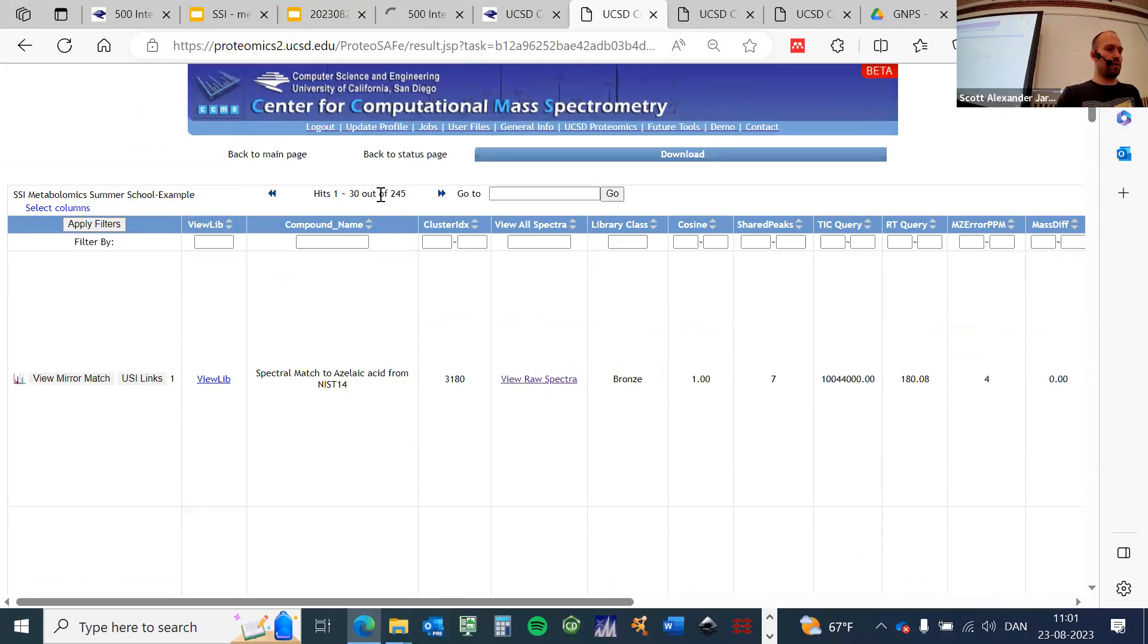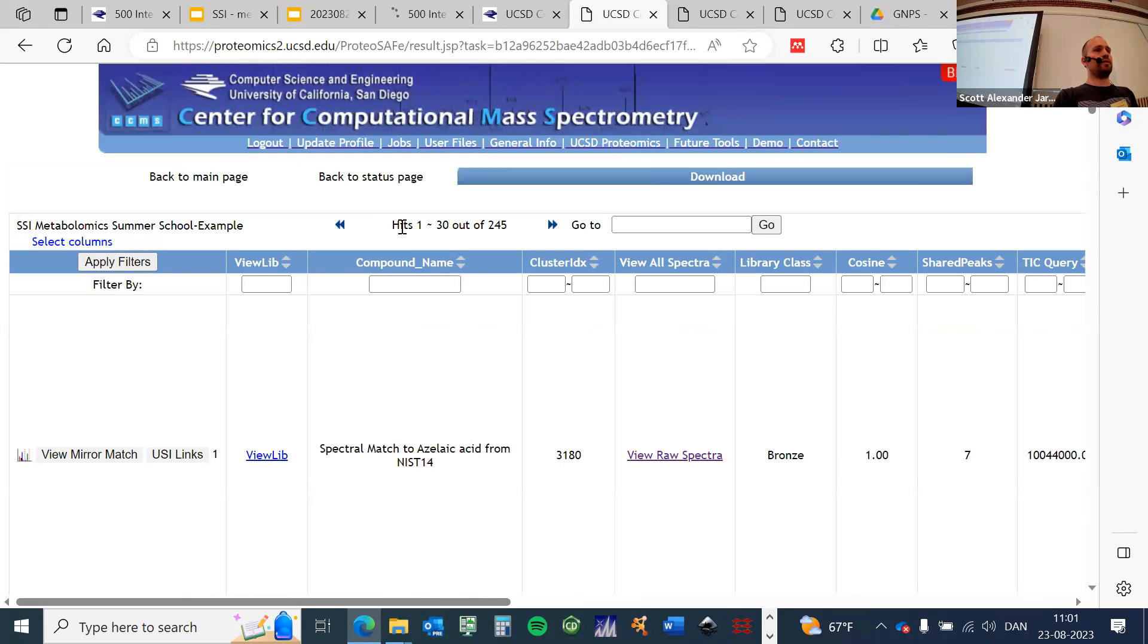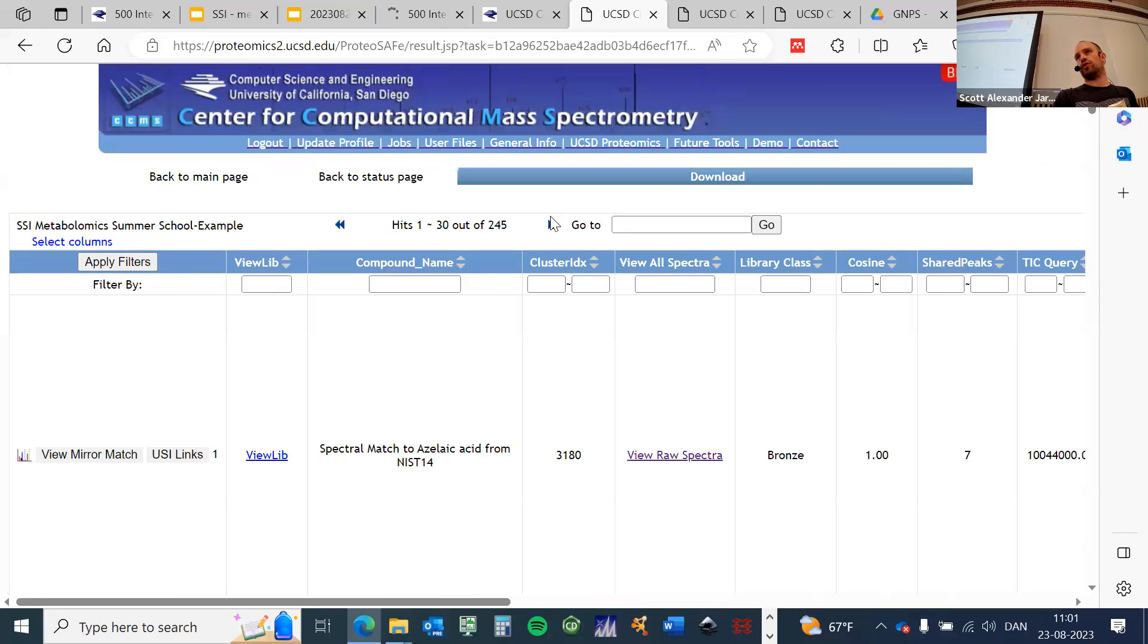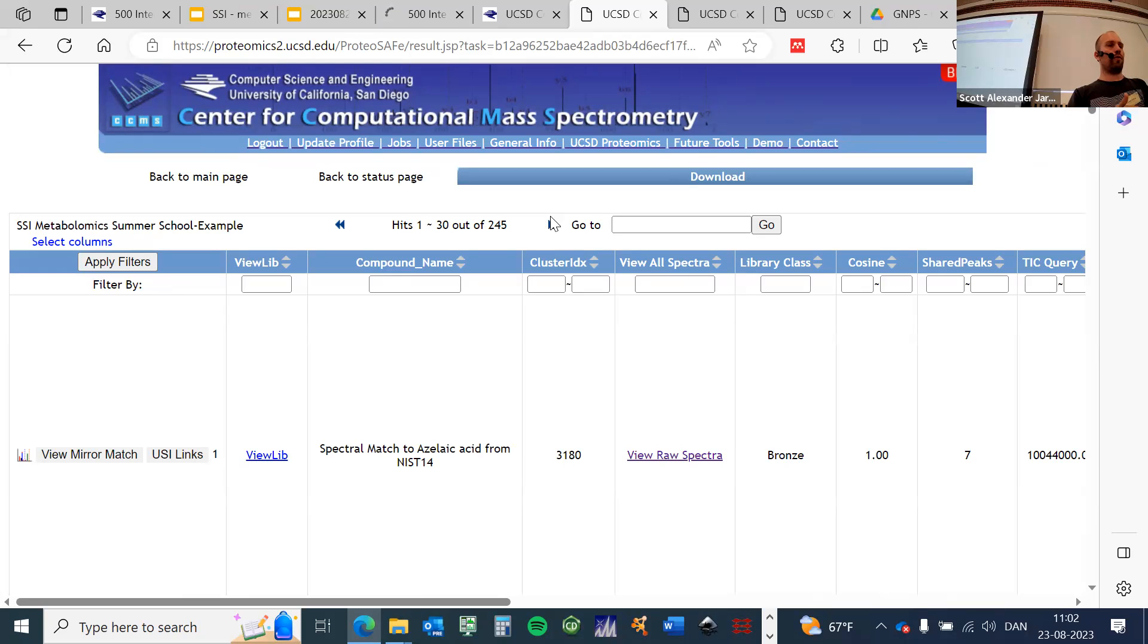I typically first look at this number here on the top. I'm going to zoom in a little bit more, which says that hits 1 to 30 out of 245 are shown. You can imagine, okay, how many features did we have yesterday? You can see what percentage of annotation you have.